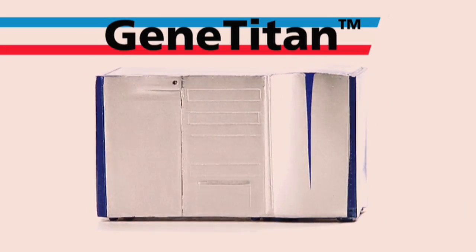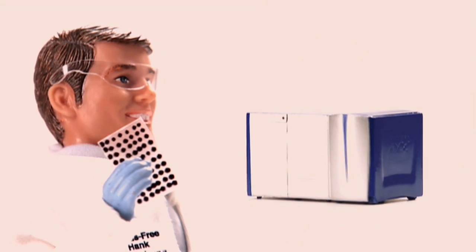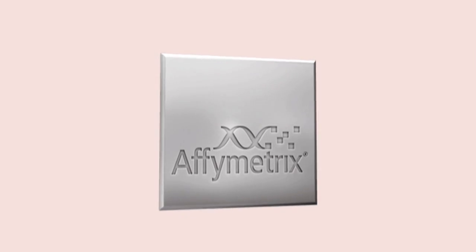Gene Titan system comes equipped with GeneChip Command Console software. Hands-free Hank, Genome Jane, P.I. Pedro, array plates, and assays sold separately. From Affymetrix.